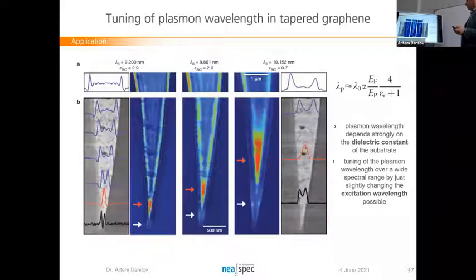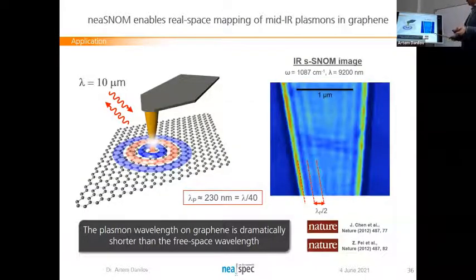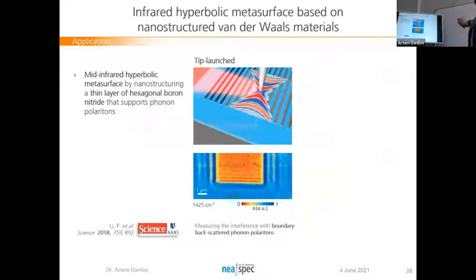Here are some other slides where people tuned the frequency of oscillation between 9 and 10 microns. I have to add one thing. What we're seeing here is not the polariton imaging itself. What we're seeing here is the interference image between the wave which was launched by the tip, reached the end of the flake of graphene, and then moved back. So basically, the period of this pattern is different by a factor of two compared to the real period of a polariton. Here we played a little bit again with frequencies, and we created patterns of different standing waves across this graphene. I'm going to move a little bit faster because I think I'm limited in time.